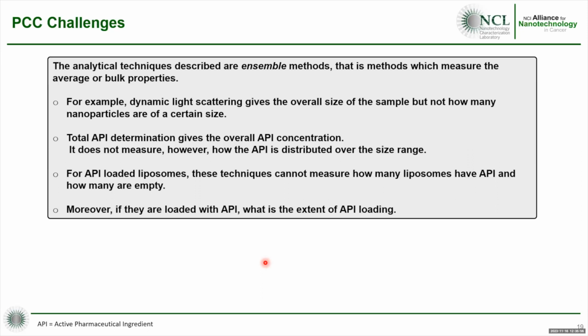The size is the same for both populations. And finally, if they are loaded with API, to what extent is it loaded? So these are kind of questions I always ask when I approach new technologies, to see if they can address these issues.